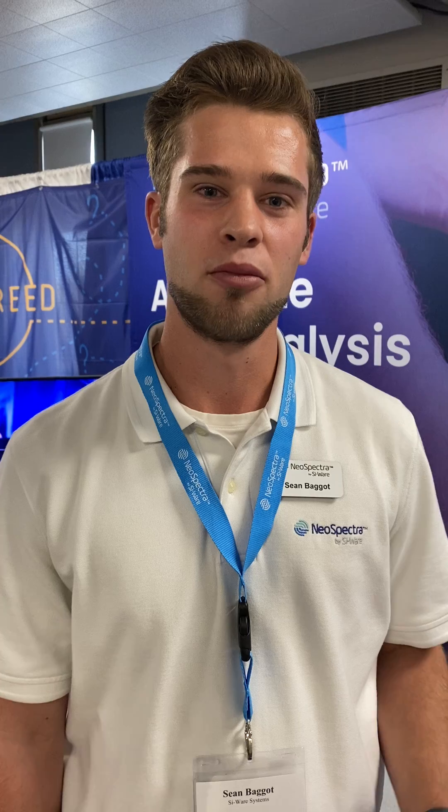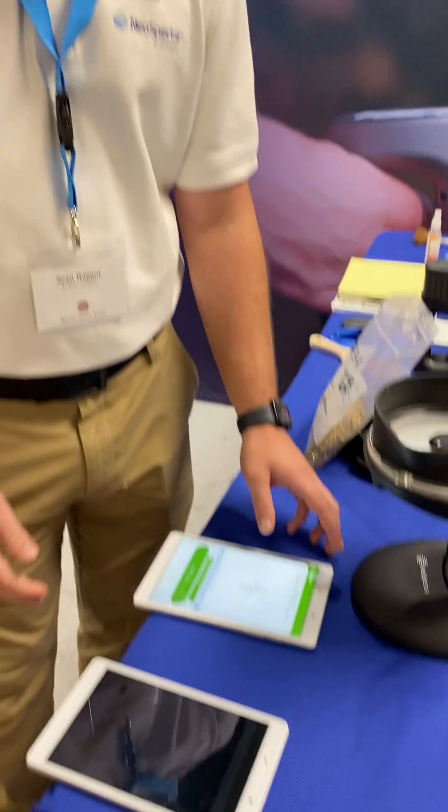Hi, I'm Sean Baggot. I'm a technical sales engineer with Si-Ware Systems. Today I'll be showing you how to use the portable rotator to measure dry hay using the Dairyland Lab calibrations.